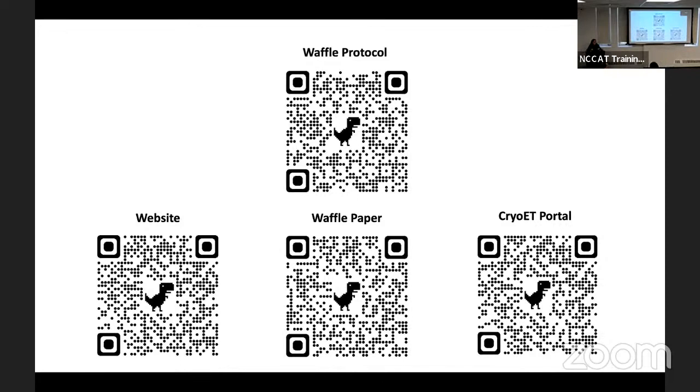Can you work with adherent cells? That's one of the issues. I know Reza tried just having the cells on a grid, then applying buffer and just HPFing it. I think it worked, but if you don't have to do it, then don't. Actually, Reza did something even more fun: he did Primo micropatterning, so he had clumps of cells in the middle of each square. Then he HPF'd it, put the buffer layer on top, and HPF'd again. So, yeah, that worked.